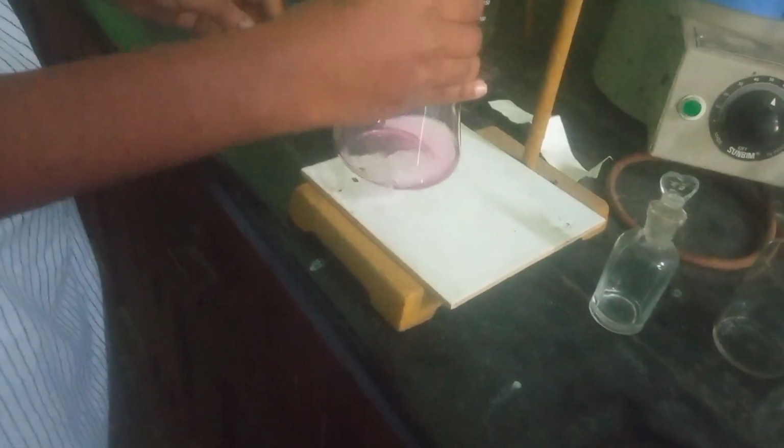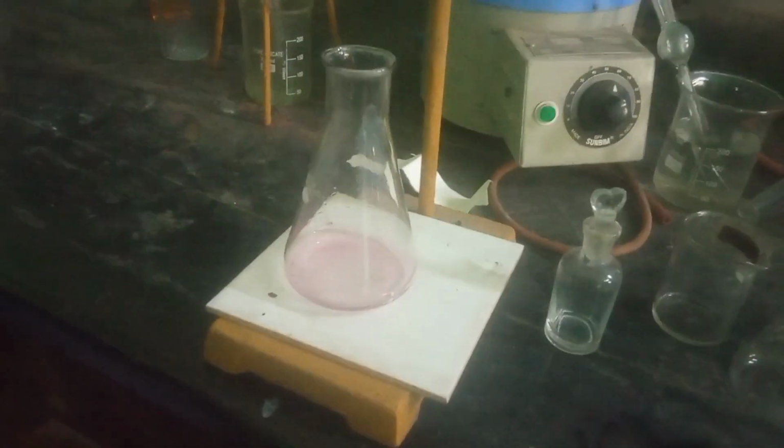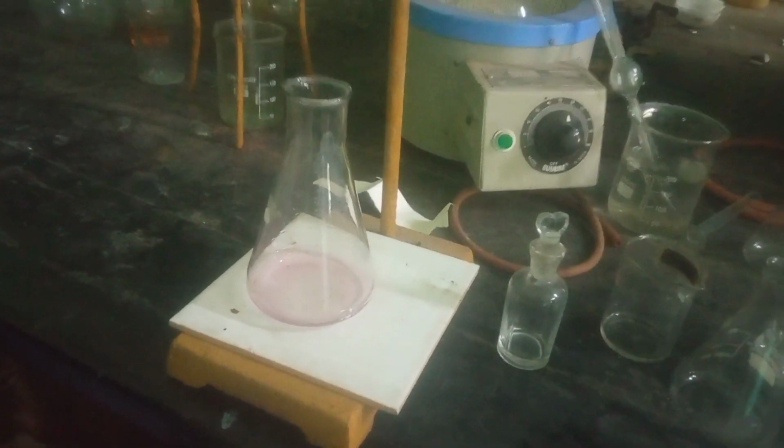So by doing this, the students will get the initial volume of NaOH required to neutralize pure acetic acid, and then the volume of NaOH required to neutralize the acetic acid mixed with charcoal.